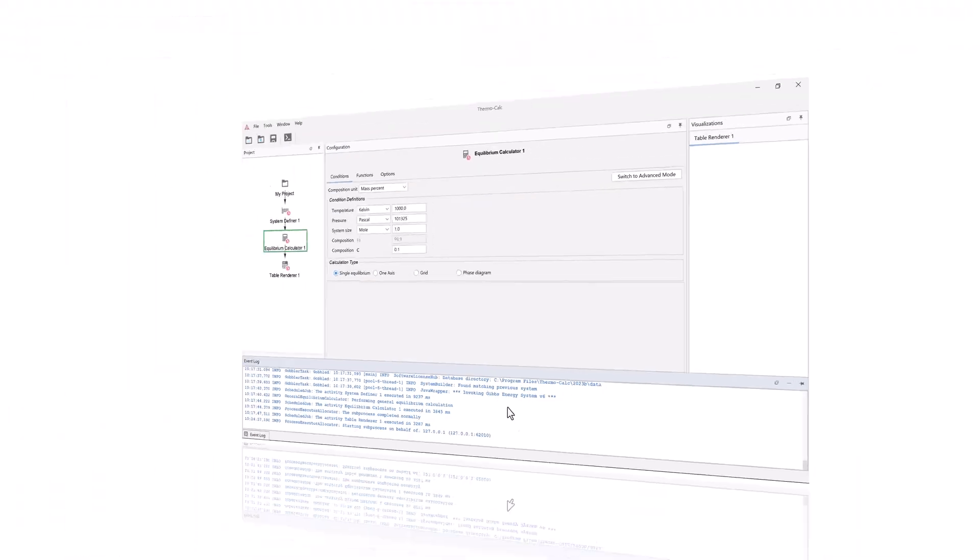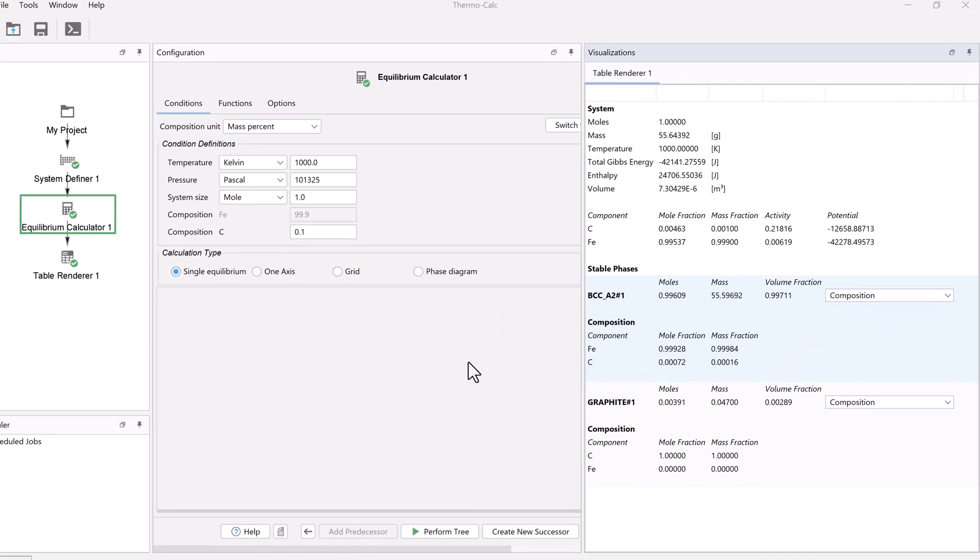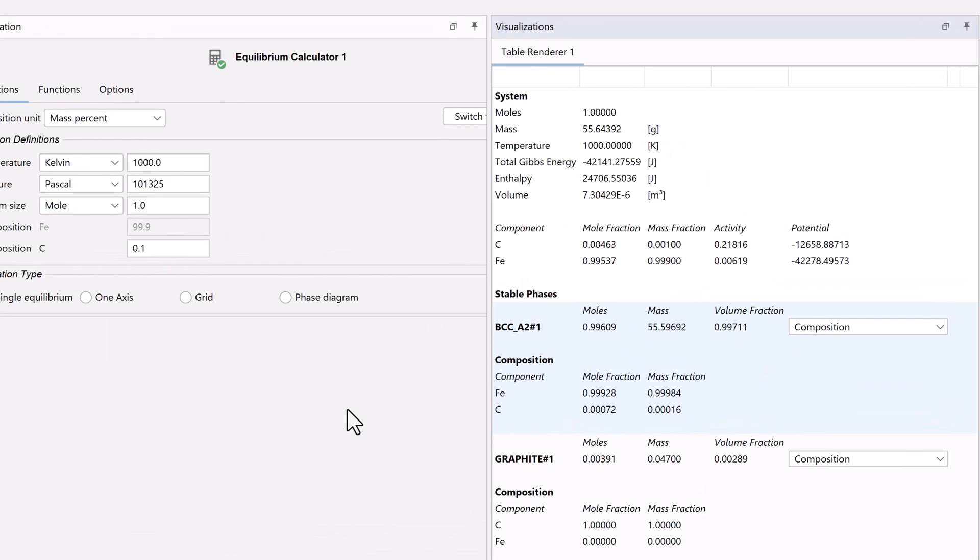Once the calculation is complete, a table will appear in the visualizations window. Note that your results may vary slightly depending on the version you have. The top section of the table gives you information about the system.